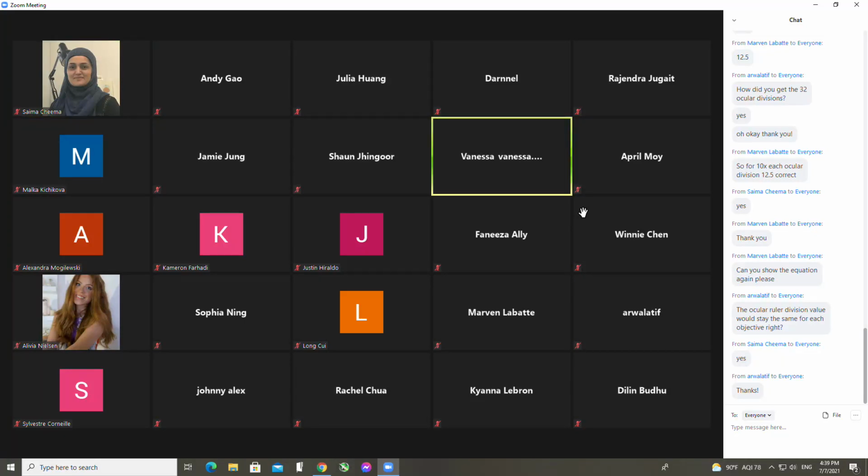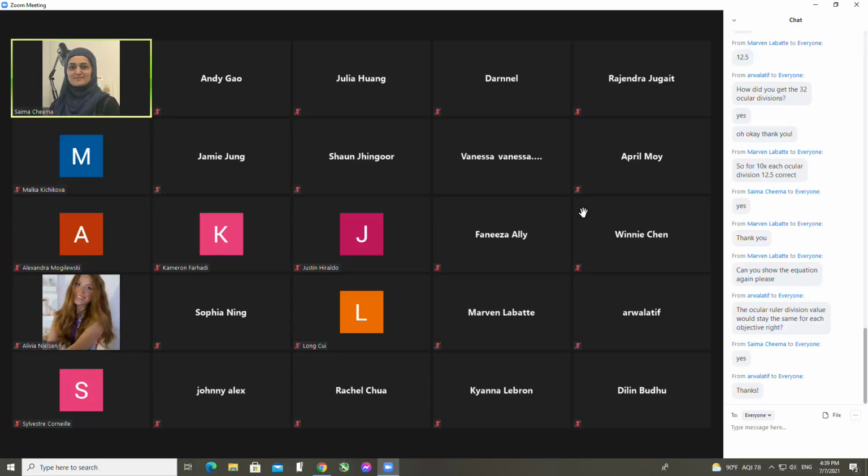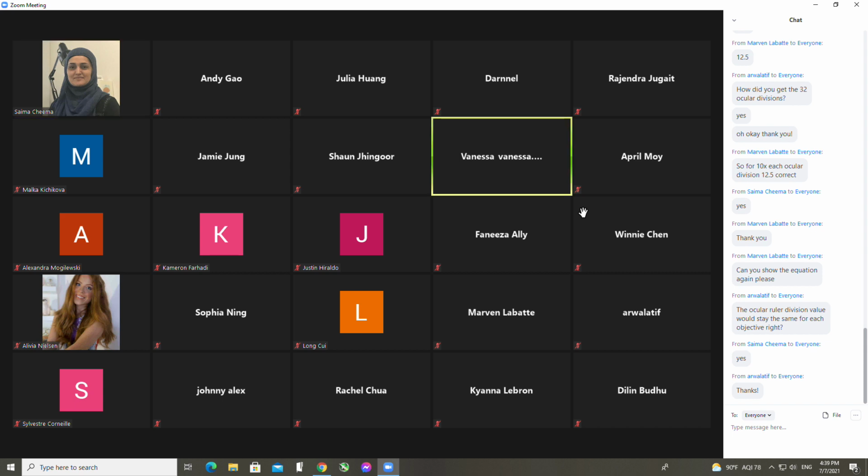Professor? Yes, Vanessa. For the diatom, does it matter which one we're measuring? You can measure any one of them, just keep on measuring the same one for the other magnifications. Okay, got it. Should we specify which one we're measuring, like the longer one or the circular one? Yeah, sure. Okay, thank you.